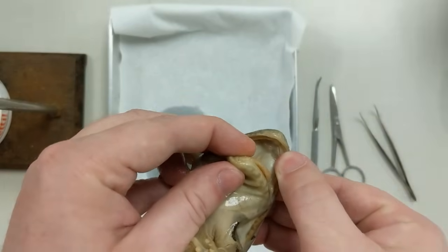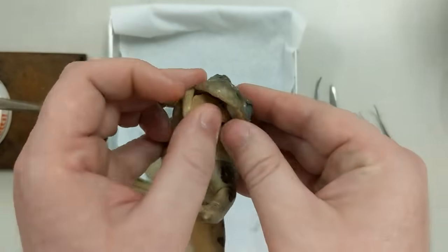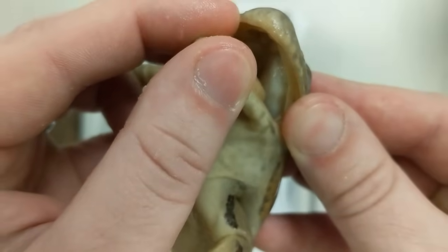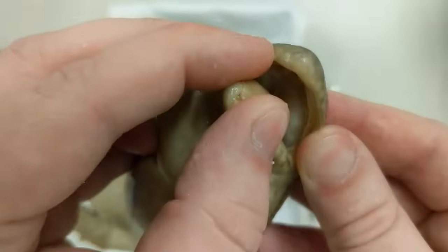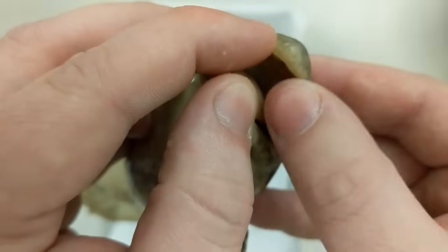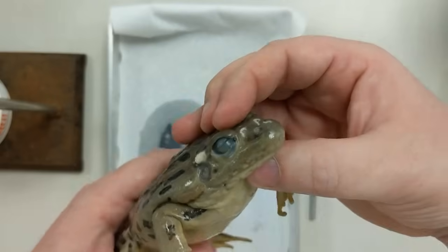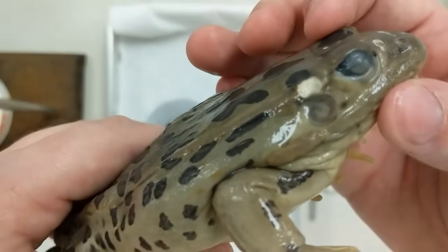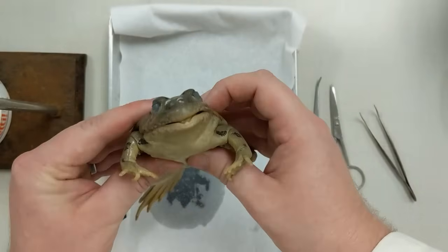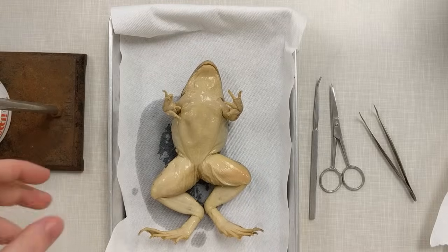You'll be able to see his two vomerine teeth — his little buck teeth right at the top. If you feel them, they're really hard and razor-like. Along the sides, he's got a nice little tooth ridge that feels like a serration, like a serrated knife going across there. That covers the external features — obviously you've got the eyes and the tympanic membrane as well, but that's everything from the outside.